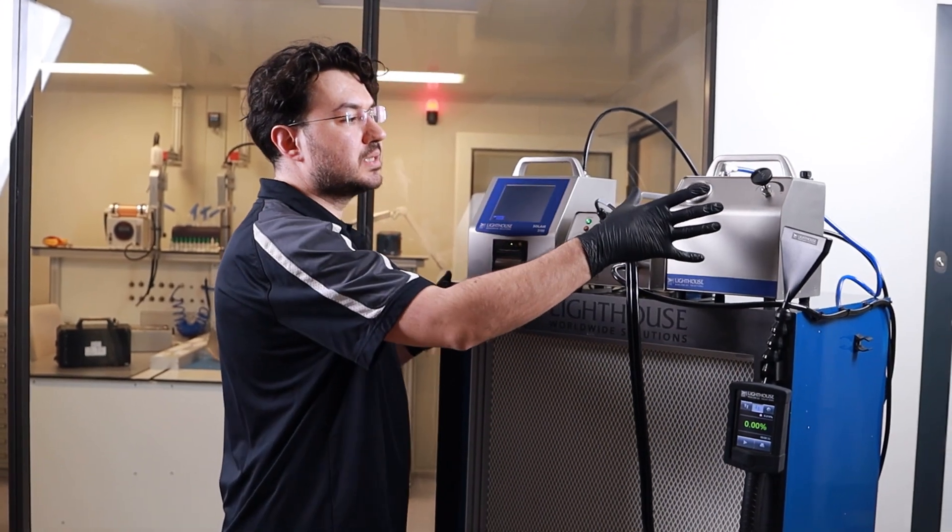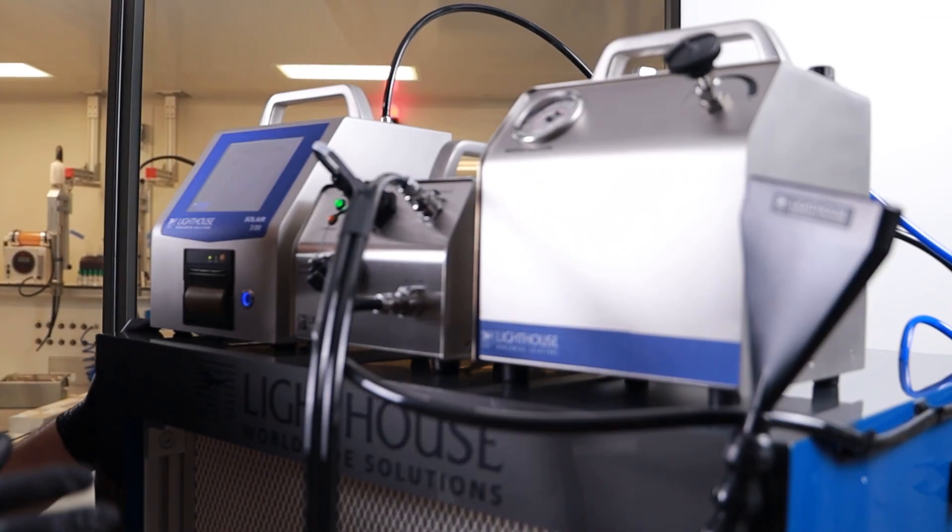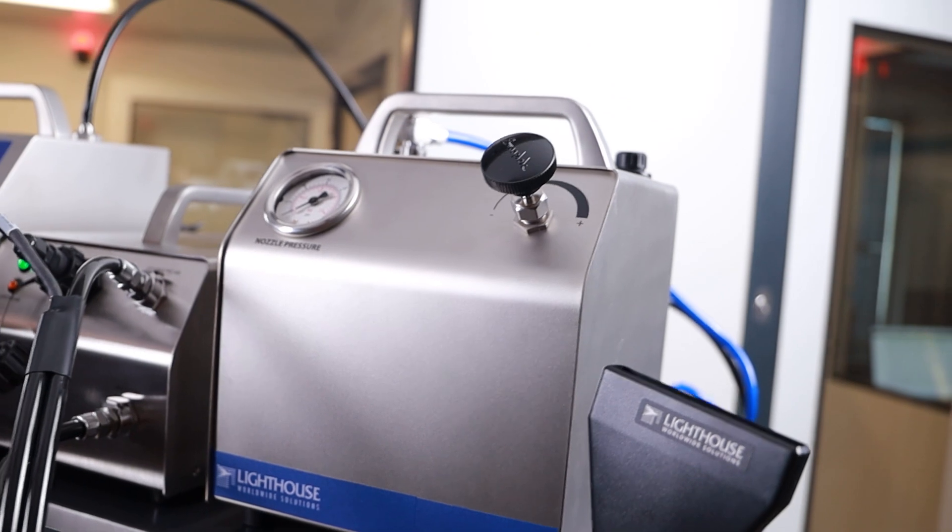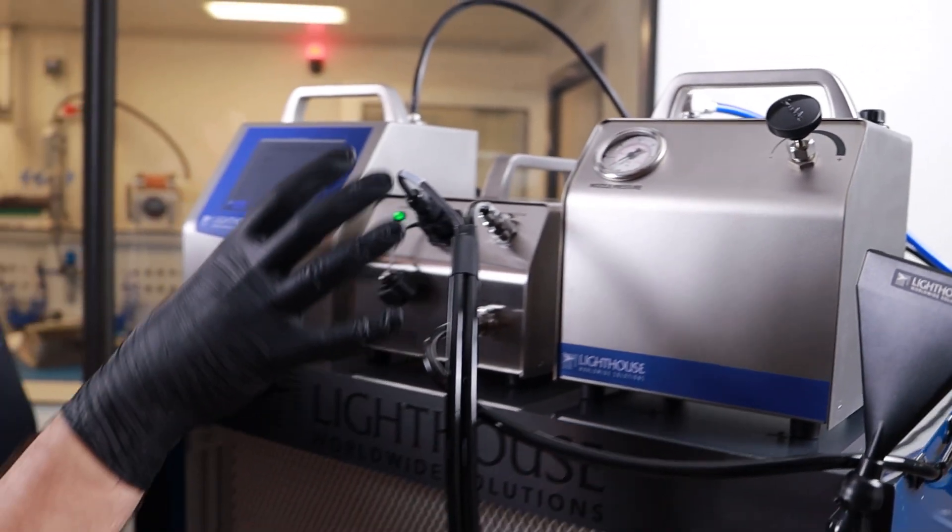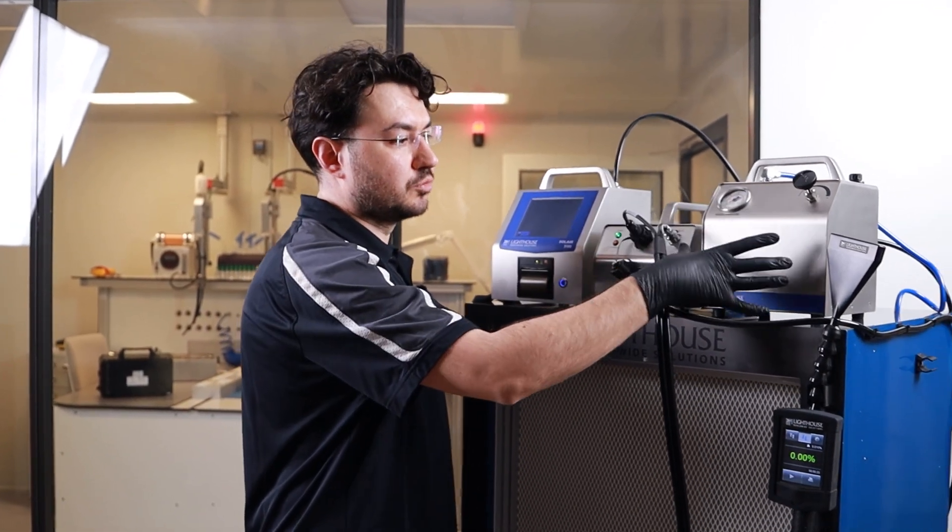Last piece is our aerosol generator. Different than the photometer aerosol generators, this aerosol generator has a quarter Laskin nozzle in it and this allows you to consume less aerosols compared to photometers as well as a small footprint.